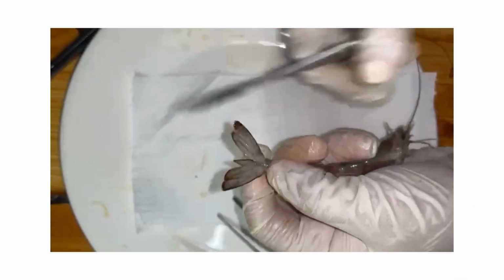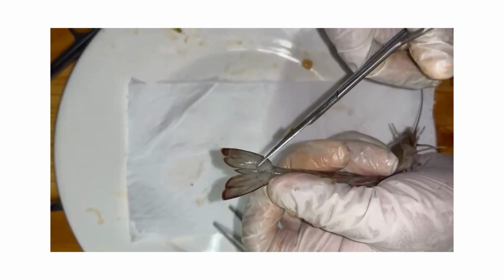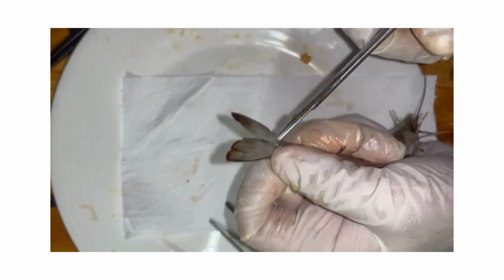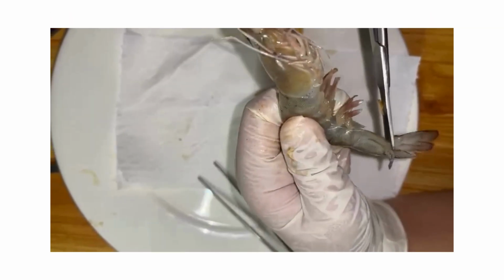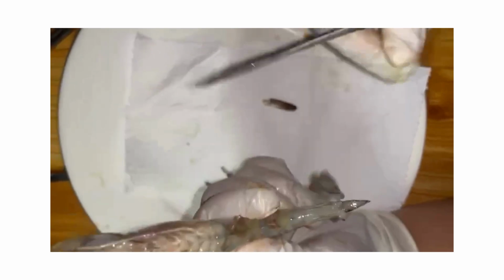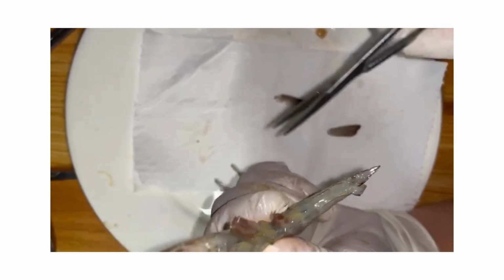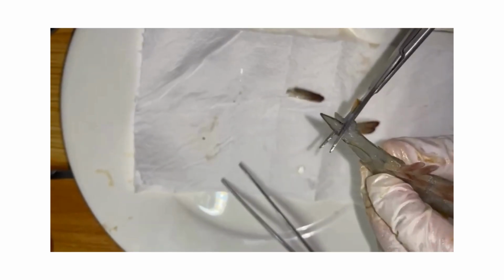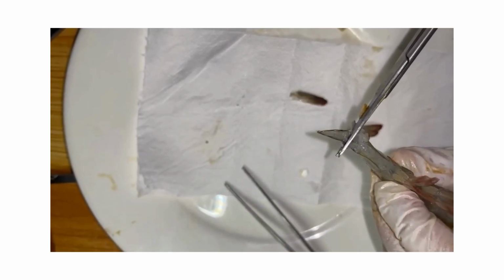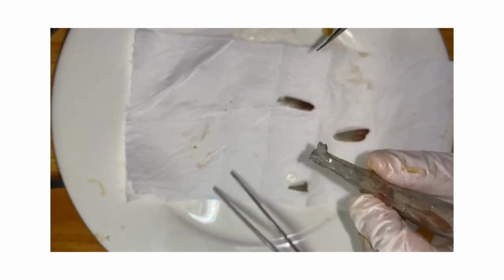To begin, gently extend its tail and, using the dissecting scissors, the uropods are carefully removed, followed by the removal of the telson. Care should be taken to avoid damaging the intestine, which runs through the tail and ends just before the telson. Removing the tail fan also helps in understanding how shrimp propel themselves backward when using sudden flicks of the tail.